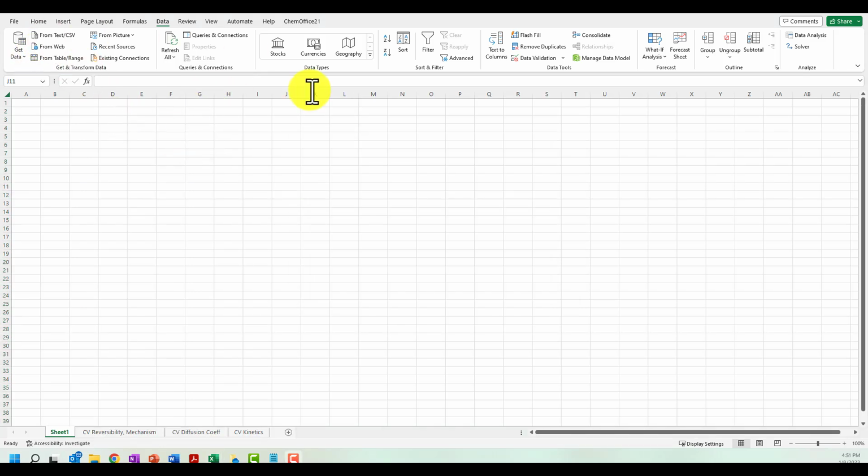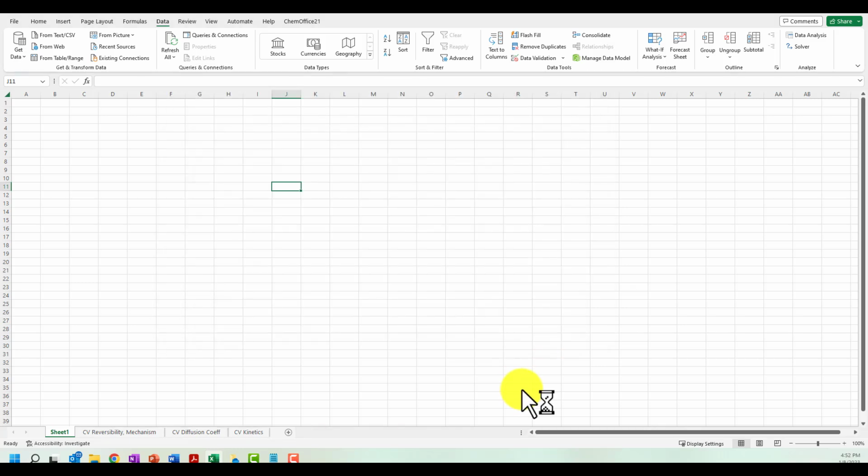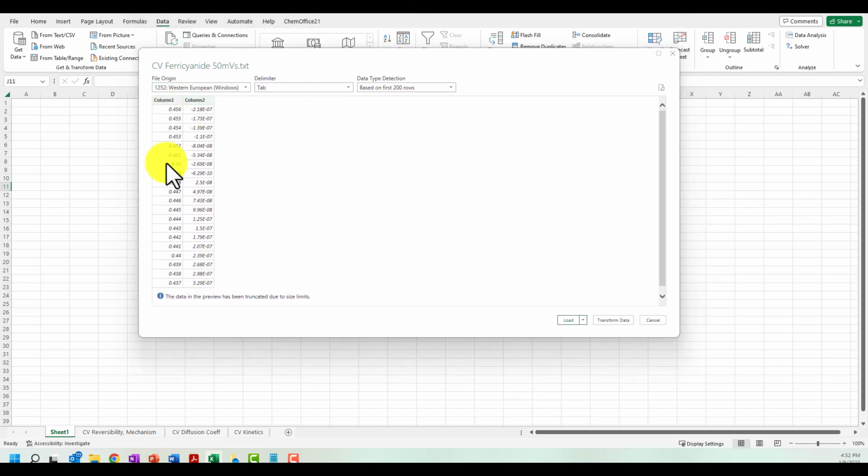Okay, last case is in, again, a blank sheet. If none of this works, or if you'd like to take this separate tack, totally up to you. Again, navigate to Data, and then this section is all about importing or transforming data. So click From Text or CSV. This will open up a different wizard. Select the text file that you want to use, and then the wizard will look very similar to the one I just showed you, where I will have the columns of data parsed by whatever the delimiter is, and the computer is going to choose what it thinks is the best delimiter.